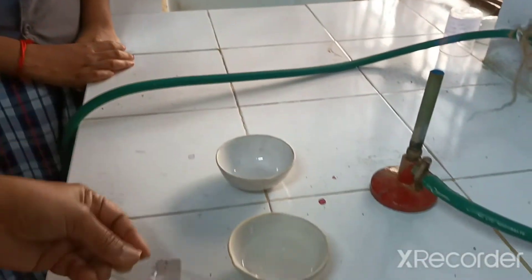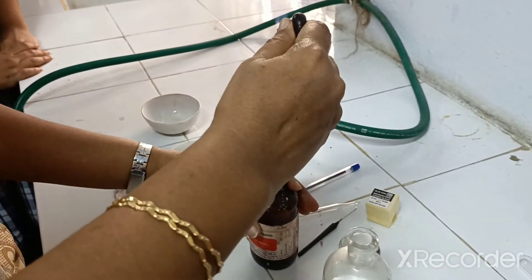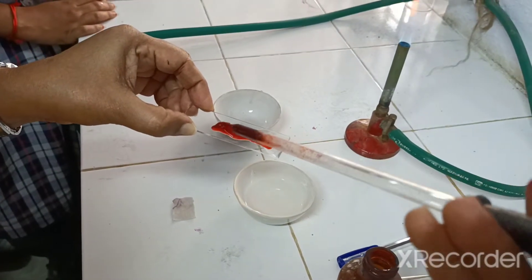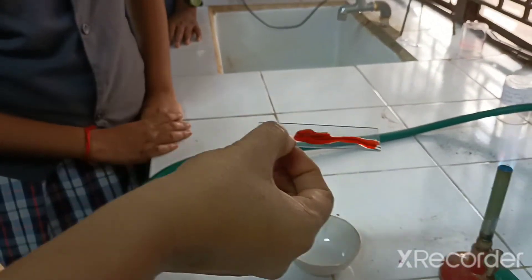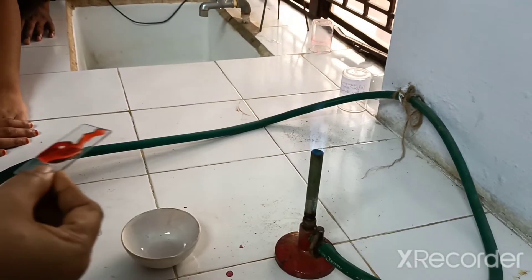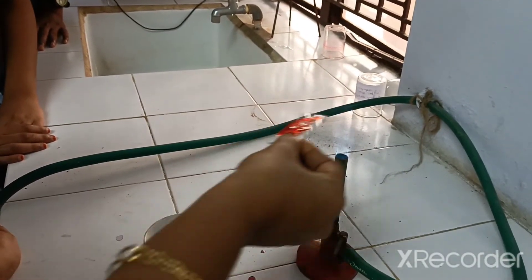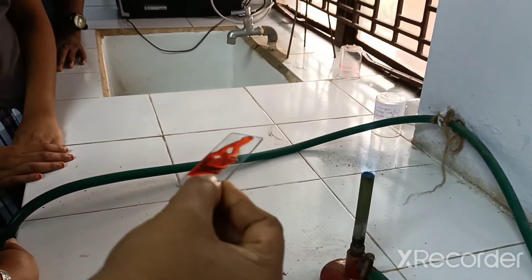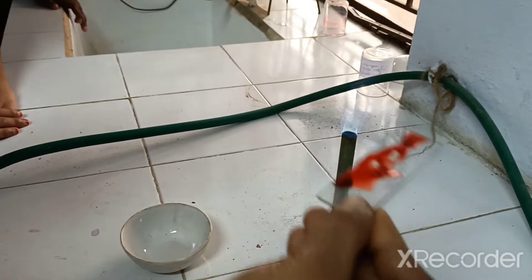Now the slide can be stained with acetocarmine. We add a few drops of acetocarmine and then heat it — don't overheat, as it may break the slide. Hold the slide slightly above the flame. Continuously move it — show it to the flame and take it out — just to warm it up. Can you see the changing color of the root tip? It is slowly getting changed.